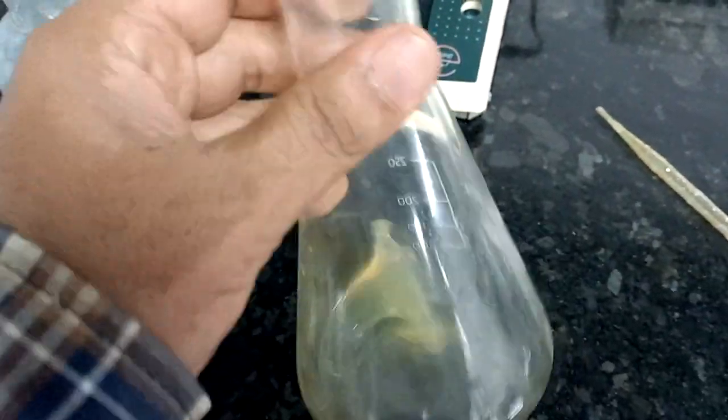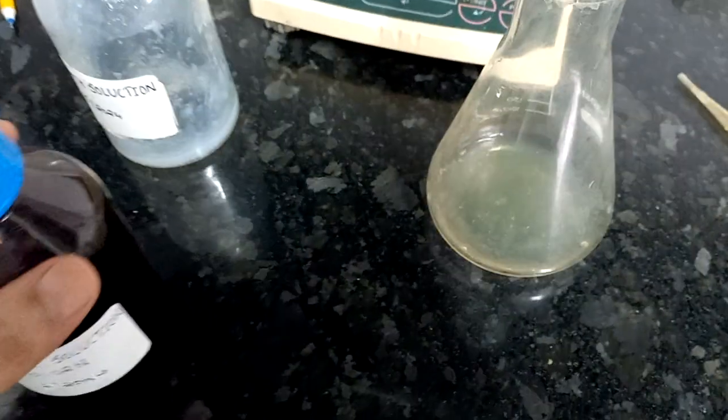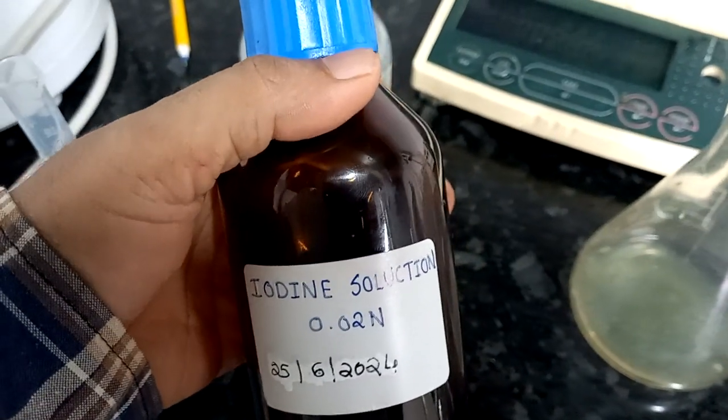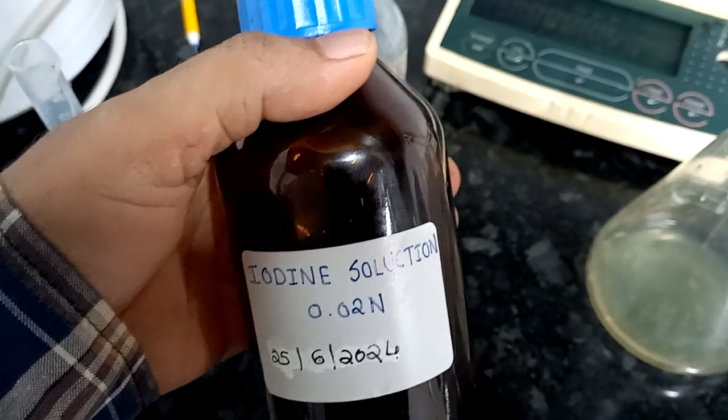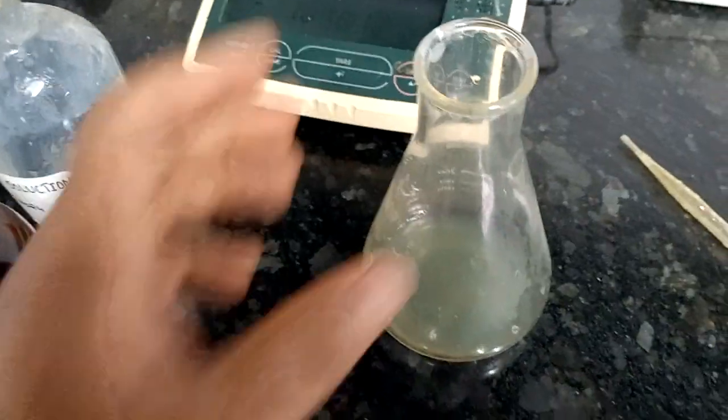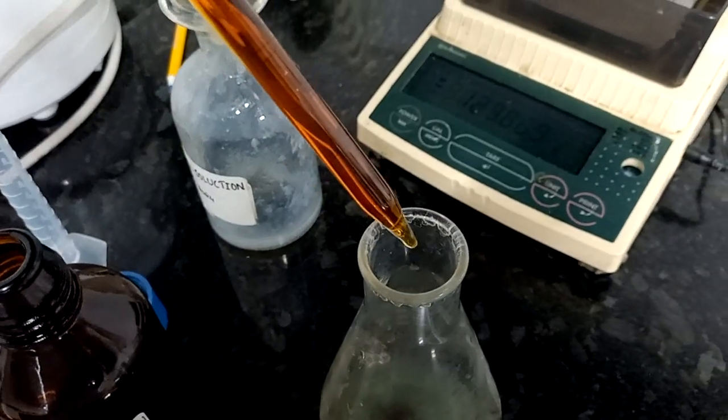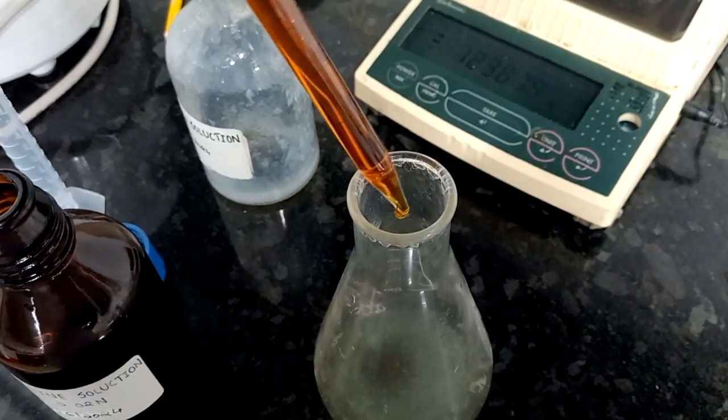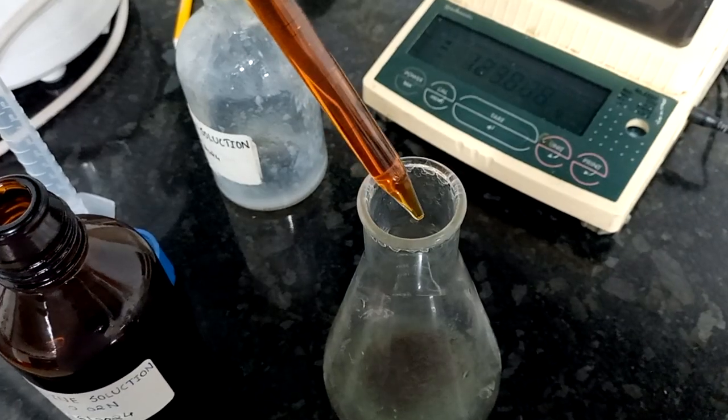Shake well, then take iodine solution 0.02 normality and titrate against this sample solution. Add iodine solution into the sample and measure the reading.